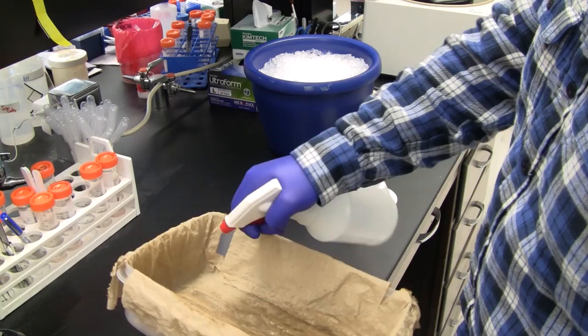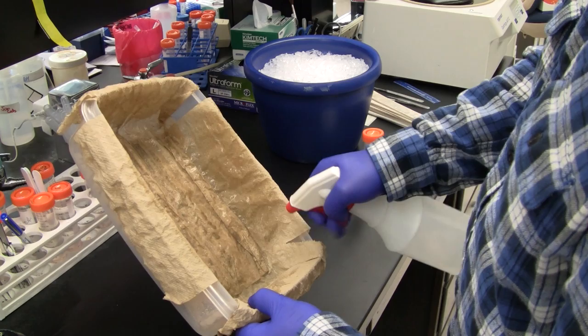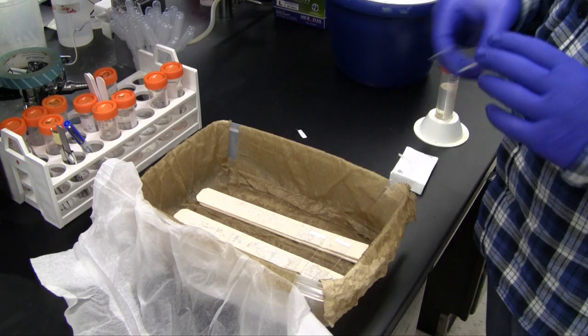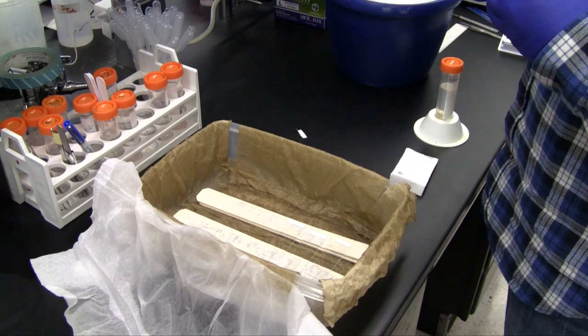Because high humidity is required for spreading of the cell preparation, a humid chamber is prepared by spraying water on the paper towels lining the container. Paint stirring sticks are placed into the humid chamber to elevate the slides. Labeled slides are then placed onto the sticks.